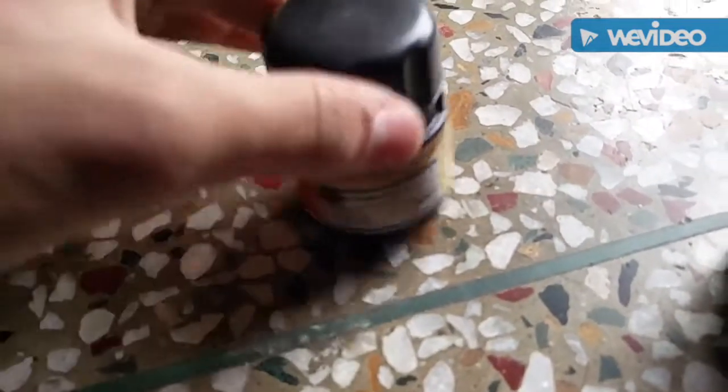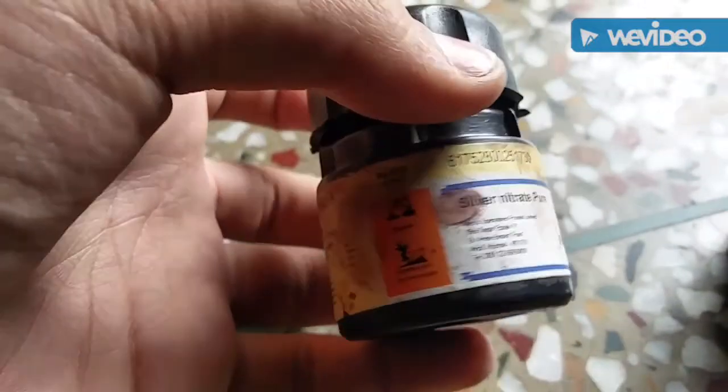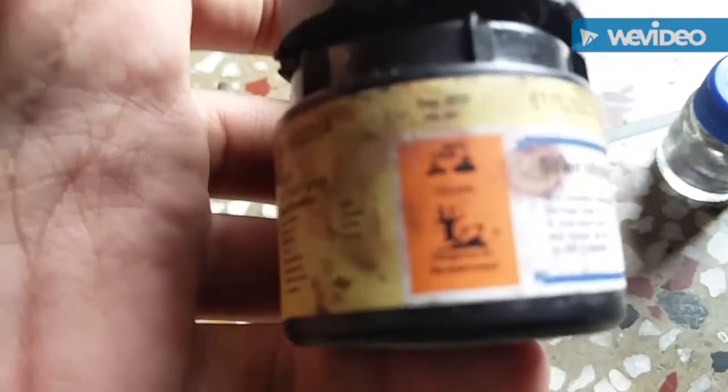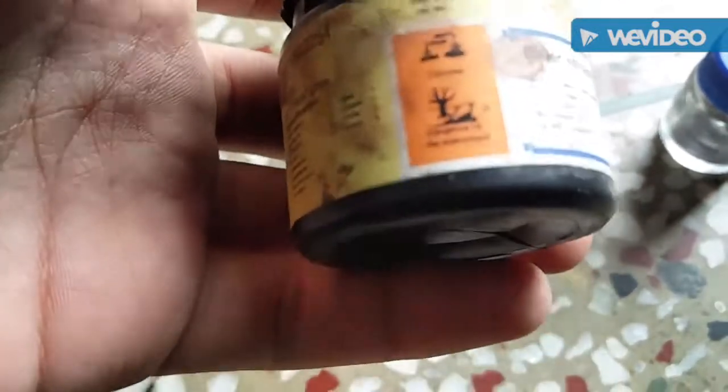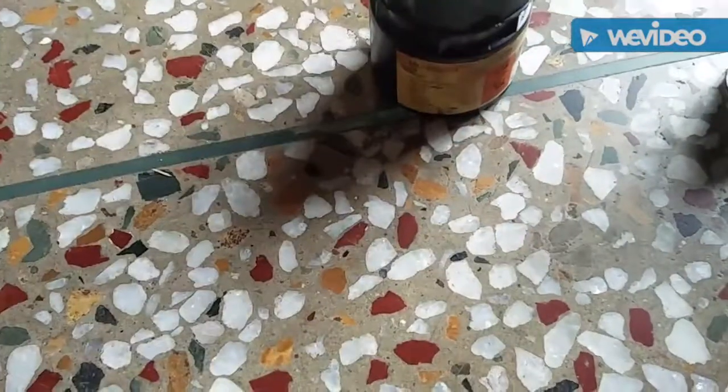Hey guys, today we are going to make silver from silver nitrate. So disclaimer: silver nitrate is very corrosive and it is an environmental hazard, so you might want some protection for your hands.